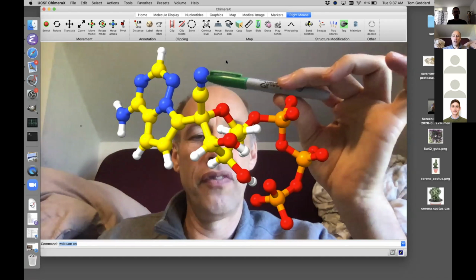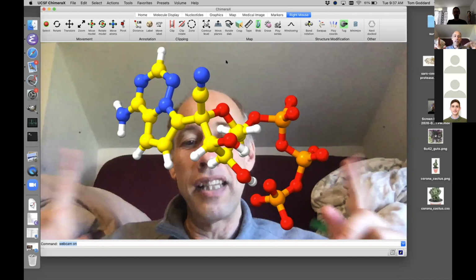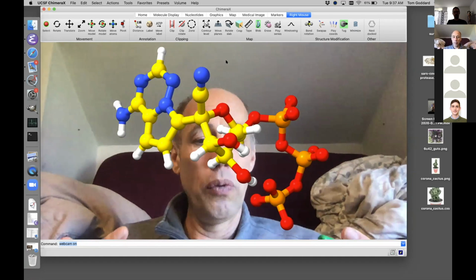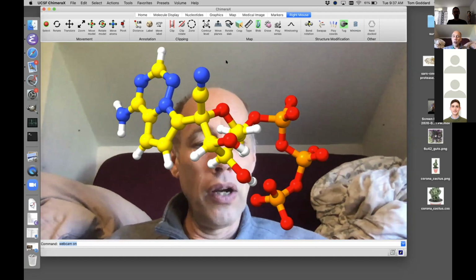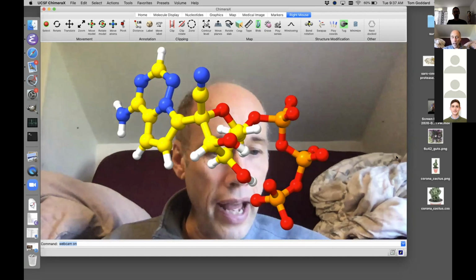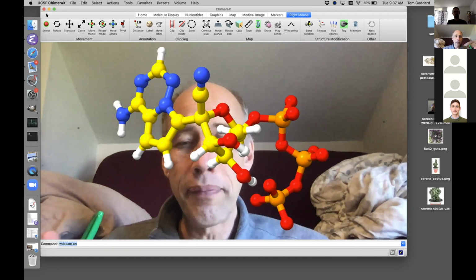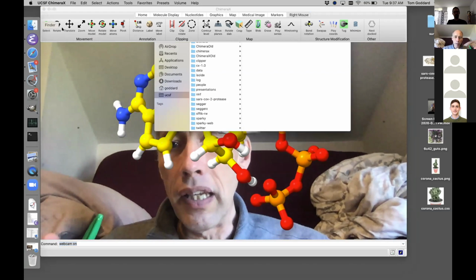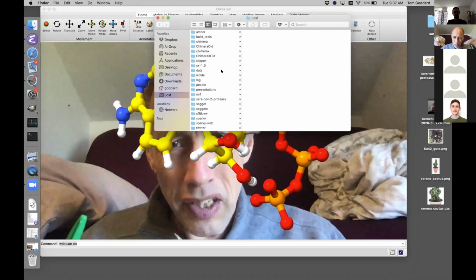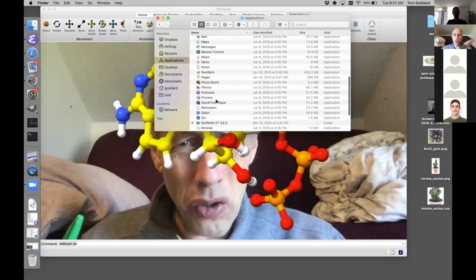All right, so that's how this augmented reality can be done with no special equipment. If I wanted to record a video of this, let me quickly show you that. I would just, on the Mac, start QuickTime Player in Applications. It can do screen recordings. Any screen recording software could work, but this one's built in.